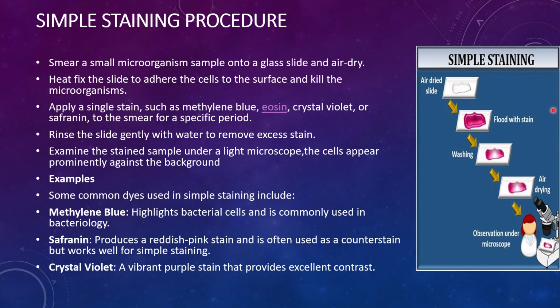So this is the simple staining method which we are going to follow. Take a slide, smear the sample, heat fix it, apply the stain, wash the excess stain, air dry, and then observe under the microscope.